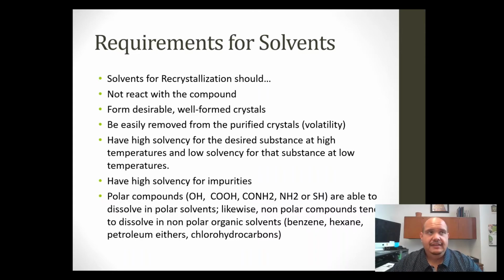And also, now, to tie all this together, there's another really important factor that has to do with your impurities. Your solvent should dissolve all of your solute's impurities at all temperatures: hot, cold, and warm. We are going to solubilize the impurities at room temp. It would be good for them to go away at that point. If not, then when they're boiling, the impurities should solubilize there.